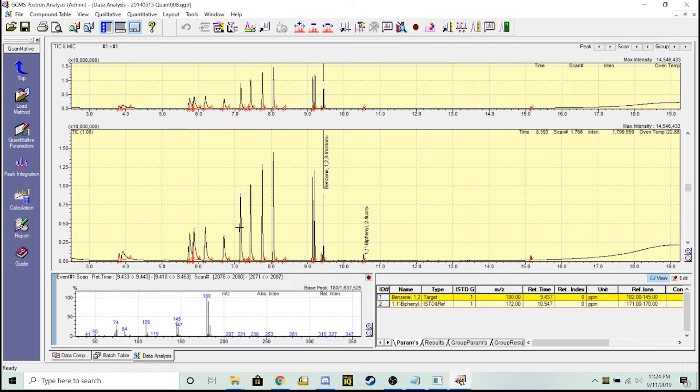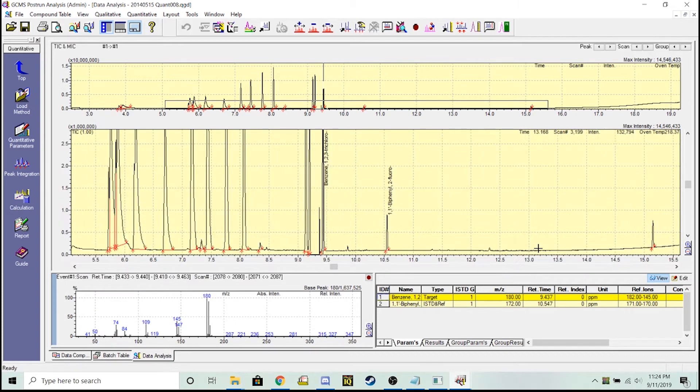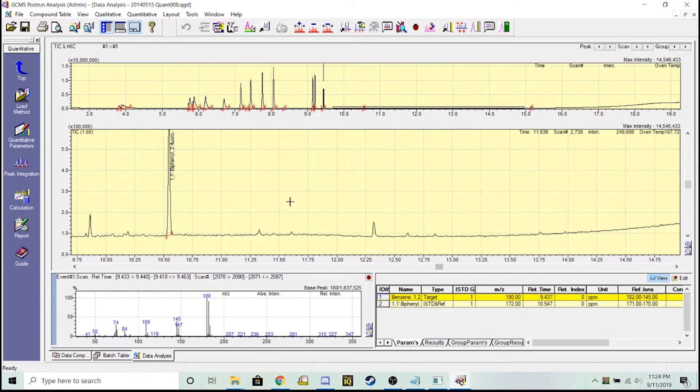It'll register things to the spectrum process table. That's what we're going to go off of. If you wanted to recap on how to do the peak integration for all ticks, I'm going to zoom in onto your baseline.